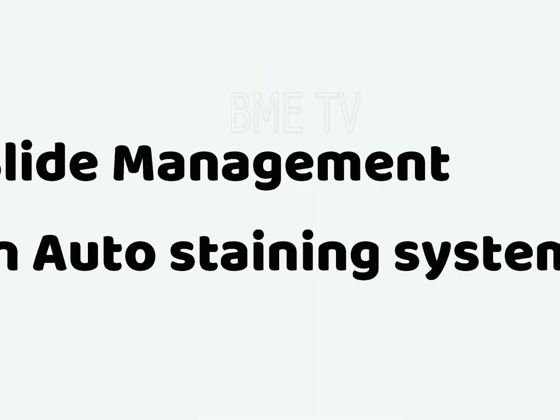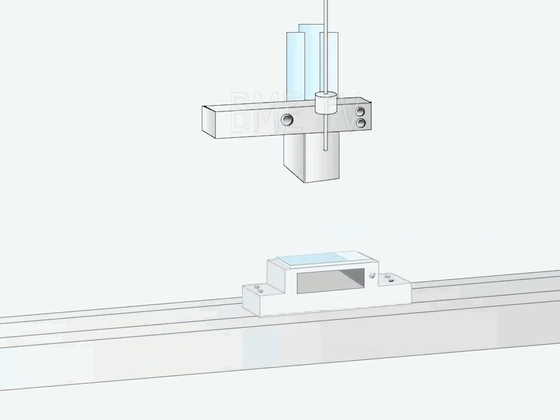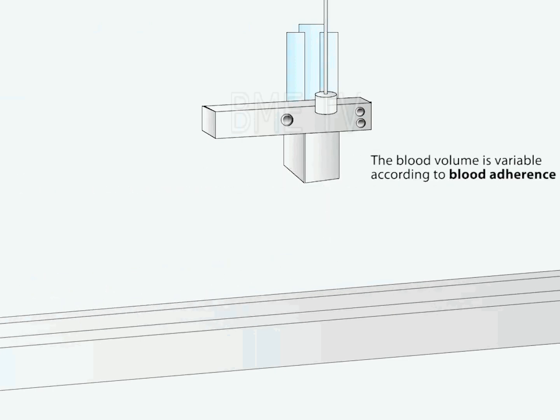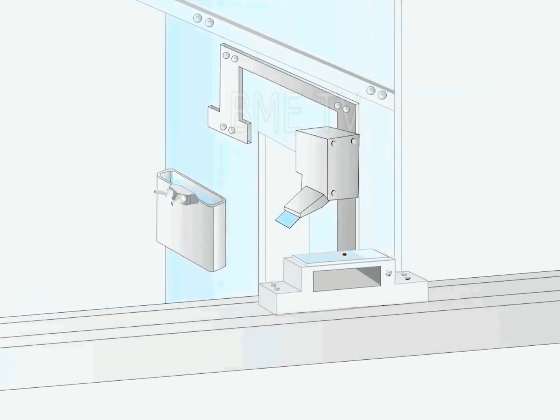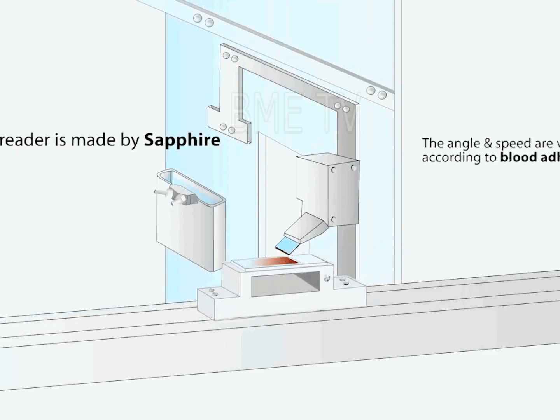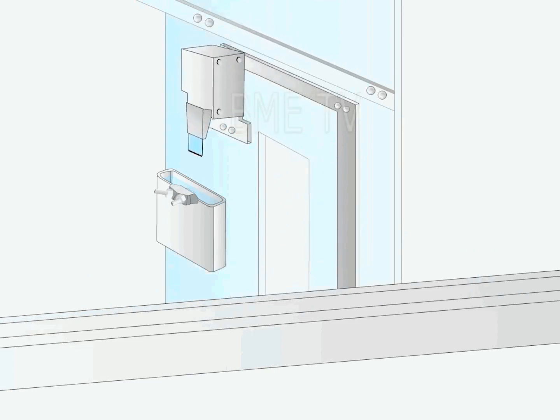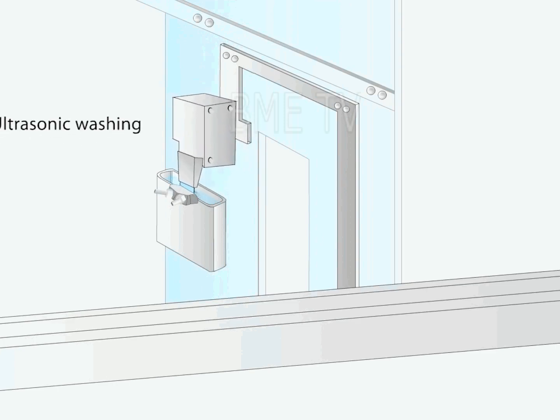The second component is slide management. Instrument vendors differ greatly regarding how slides are loaded, covered, and batched through the staining process to address overall capacity and speed. Early robotic platforms held paired slides in a vertical orientation to take advantage of gravity to apply and rinse agents from the slide surface with capillary action. This has been replaced in current systems with slides loaded in trays or racks in a horizontal orientation, with reagents applied from above and spread around the slide surface by either air or capillary action.